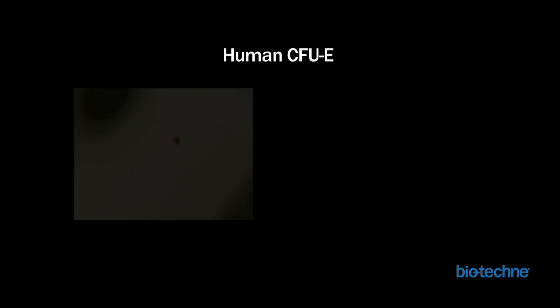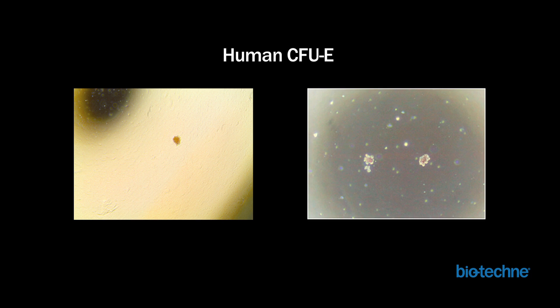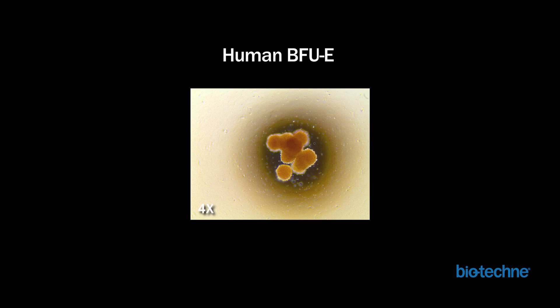CFU-E colonies, which represent more mature erythroid colonies, can be distinguished by their smaller size, more tightly packed colonies, and less intense red color compared to BFU-Es. These two images are examples of human CFU-E colonies. Now compare them to this image of a human BFU-E colony.